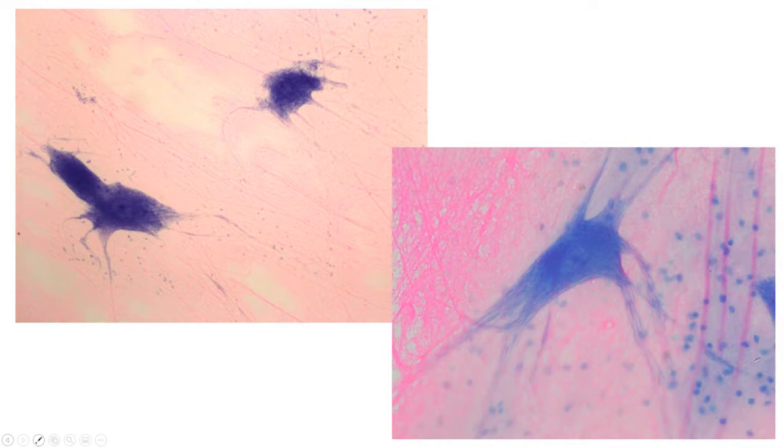Compare nervous tissue to fibrocartilage. Fibrocartilage connective tissue. Again, it's not that they really look that similar, but they do have the same colors. So that's why I mention it, just to take a peek, since they're both pink and blue. They do look very different though, I think, but just to be safe.